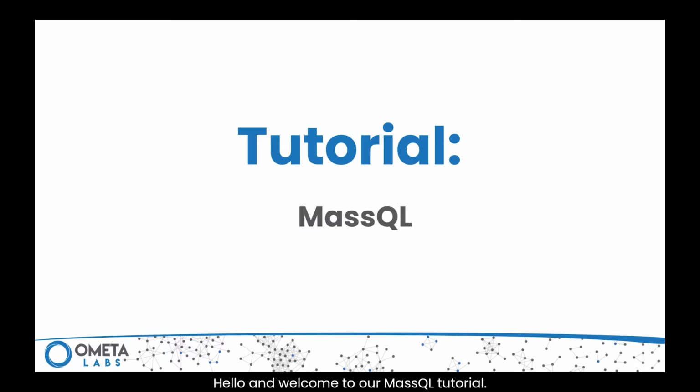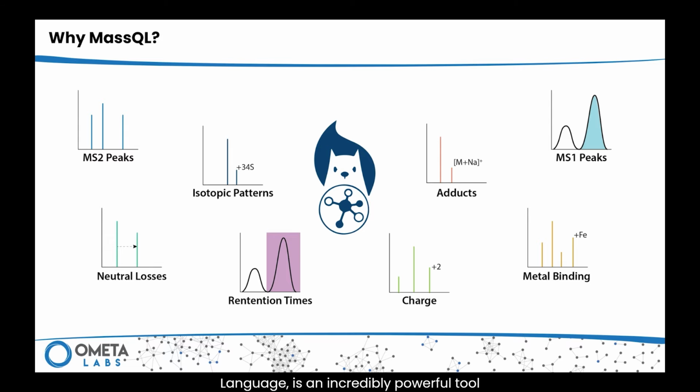Hello and welcome to our MassQL tutorial. MassQL, or the Mass Spectrometry Query Language, is an incredibly powerful tool that allows you to search for patterns in mass spectrometry data. So why use MassQL?